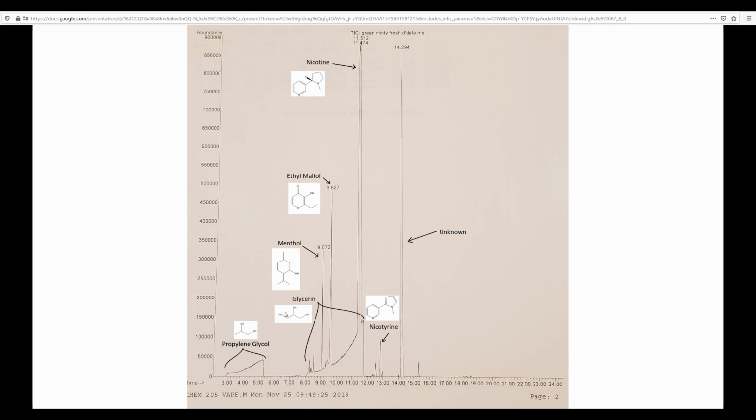The two other primary components of vape juice are glycerin and propylene glycol, and with these being more food grade products, they're not very pure, and you're starting to get pretty much all of the different polymerized compounds, with the very small and light stuff coming off early on, and the heavier dimers, trimers, what have you, at much higher intervals. The same thing goes with glycerin. As it probably heats up, it polymerizes under the heat and explodes into this large grouping of polymers that express themselves in this sort of fashion.